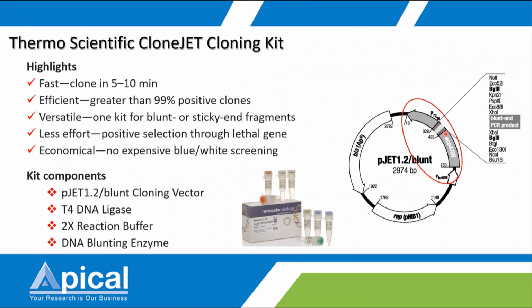This gene is a lethal restriction enzyme gene. So when there is no insert here, this gene will be expressed, and it will kill the host cell. On the other hand, if there is an insert in this gene, it will break the gene into two, so the host cell that carries this plasmid will survive. So it's much easier for the selection. That's why, as I mentioned just now, by using this kit you will have 99% positive clones.